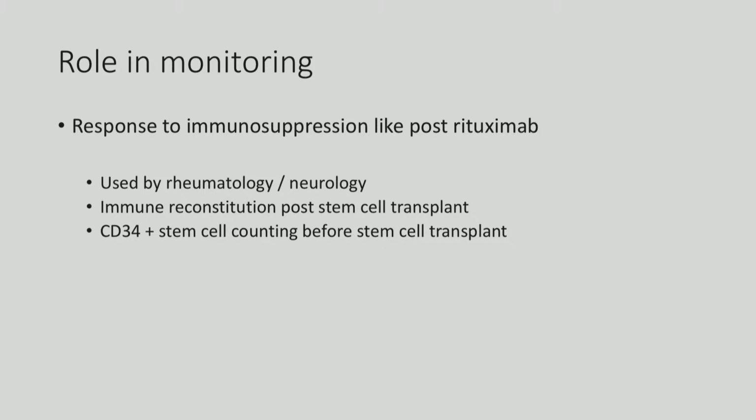by flow cytometer. As Shashidhar sir has discussed, flow cytometry can also be used to enumerate CD34 before the stem cell transplant, and that is common. We are doing this in house. We have the test available here, and this CD34 estimation is also being used by neurosurgery people for their clinical research in stem cell transplant in cord compression or spinal cord disorders.